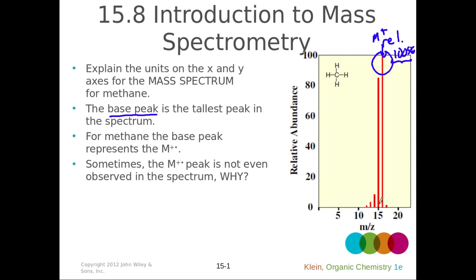So this is the general structure of different peaks in the fragmentation of alkanes. We're going to see we have bigger, smaller, smaller, smaller for each, say, methyl or methylene group. So we'll look at that a little bit later on. But basically we have mass to charge ratio, where mass is given in AMUs, versus relative abundance in the spectrum.